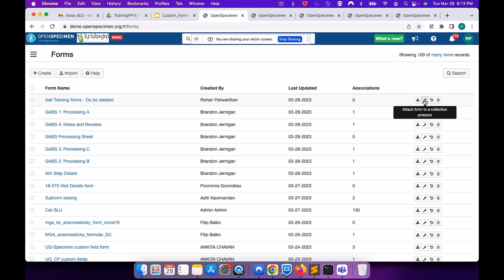So that is the reason why we say always use the forms that are predefined, because not every day that data is changed, right?